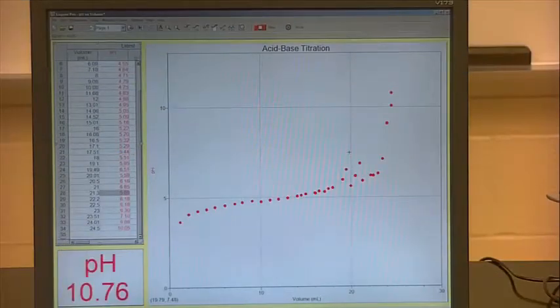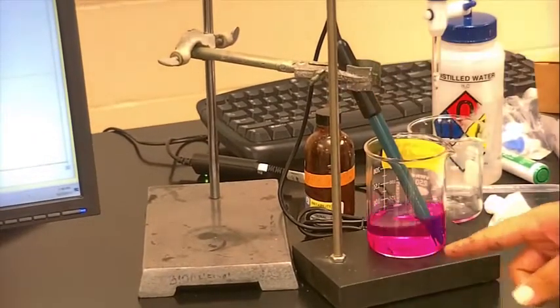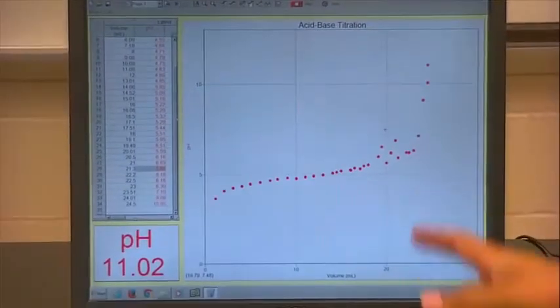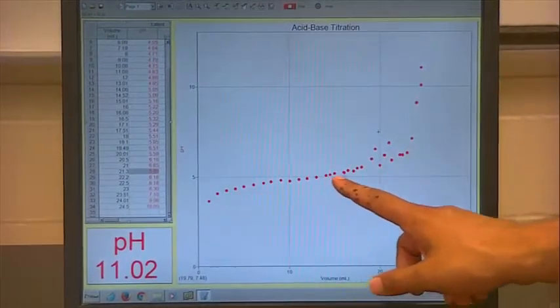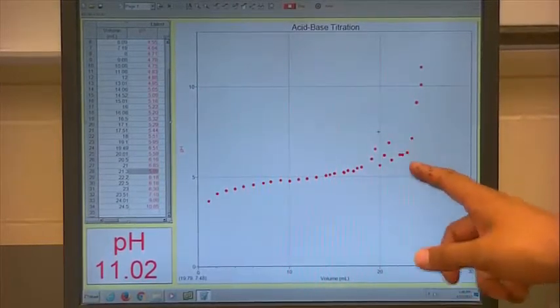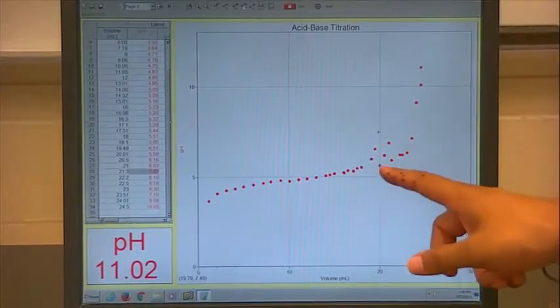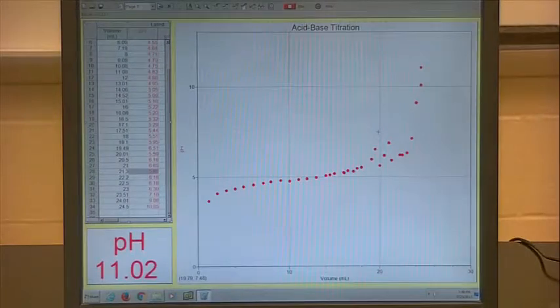Okay, so as you can see here, I completed my pH titration. Here, the solution has turned a nice bright pink. Here you can see the curve. Okay. So I kind of messed up a little bit in this regime here. You kind of want this smooth like that, but I inputted the wrong volumes or something occurred here, but that's okay. The general shape is fine. Maybe these 4 or 5 points or so, the volume got mixed up as I was reading it or something happened.